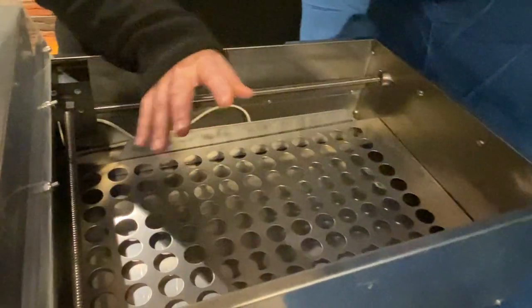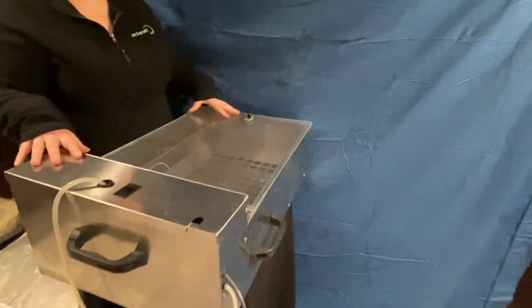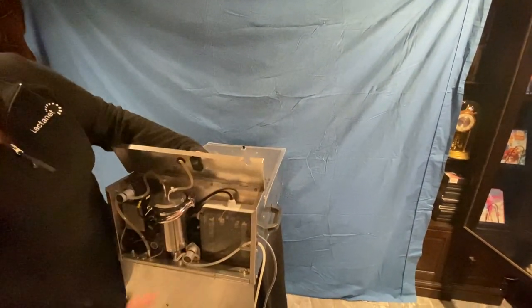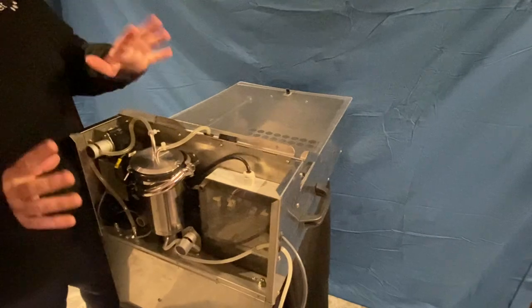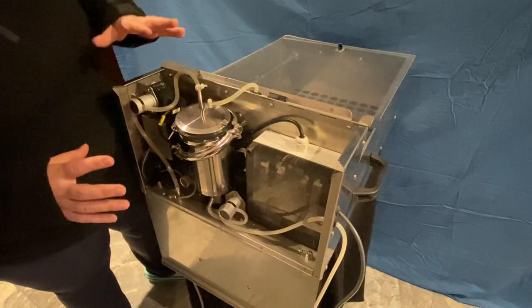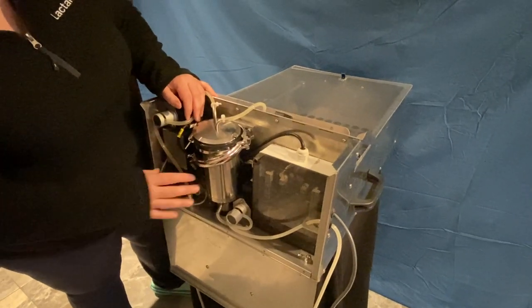The tray can easily be removed and sprayed, and the walls can be sprayed down. When closing the lid, make sure the outside is free and clear of milk and manure. The electronic box at the back contains a lot of electronics — do not spray water in this area. If milk does get in here, wipe it down with a cloth or brush rather than spraying with a hose.